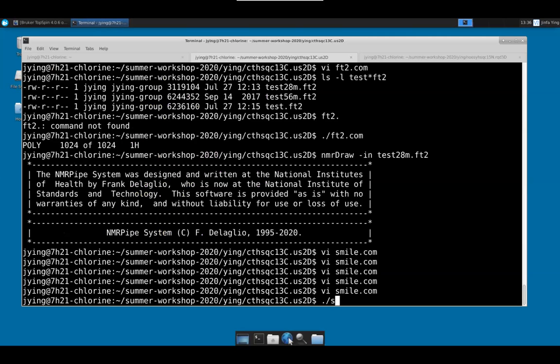Okay. So what do you mean by longer than you need for the direct dimension? For example, for protonated biomolecular NMR, we rarely do more than 100, 120 milliseconds, because the HN-H alpha splitting will lead to splitting, okay? You get a poor signal to noise and resolution anyway. So we usually do that.